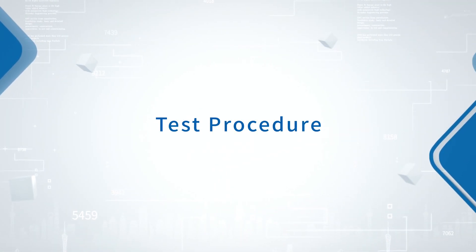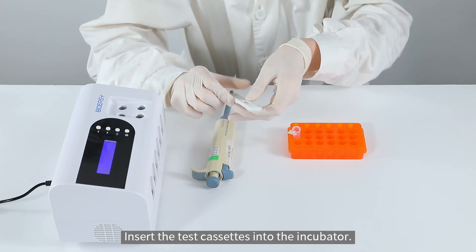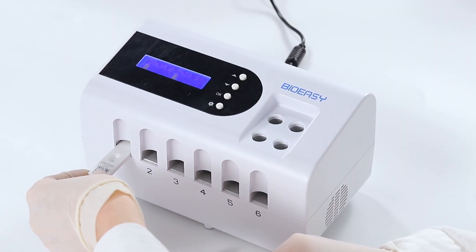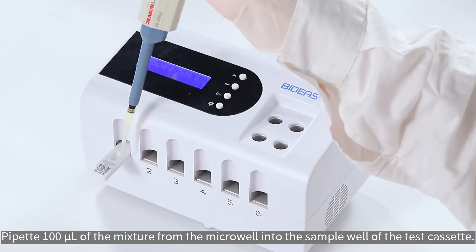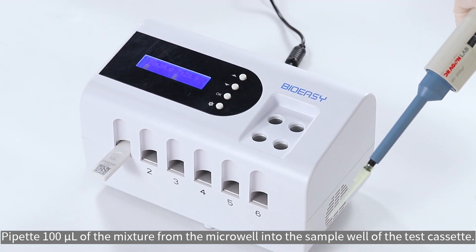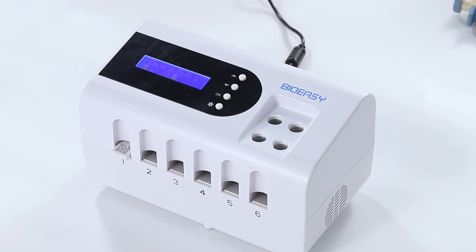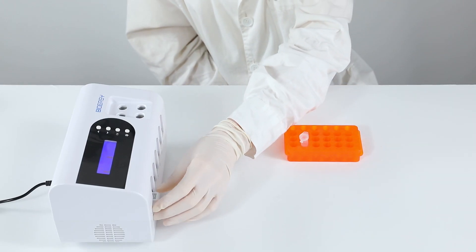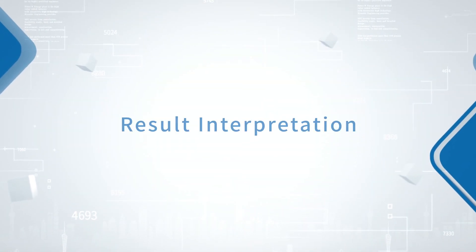Test procedure: Insert the test cassettes into the incubator. Pipette 100 microliters of the mixture from the micro well into the sample well of the test cassette. Incubate for 15 minutes, then take out the test cassette from the incubator. Result interpretation.